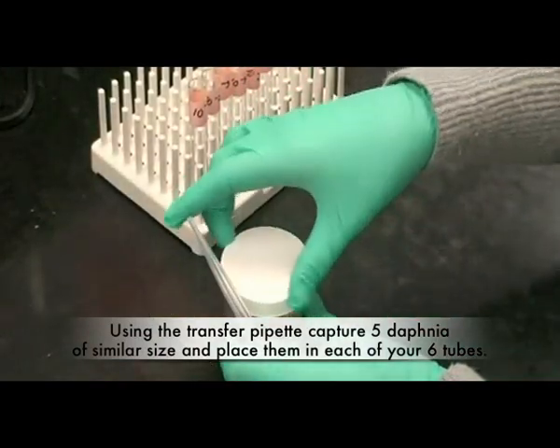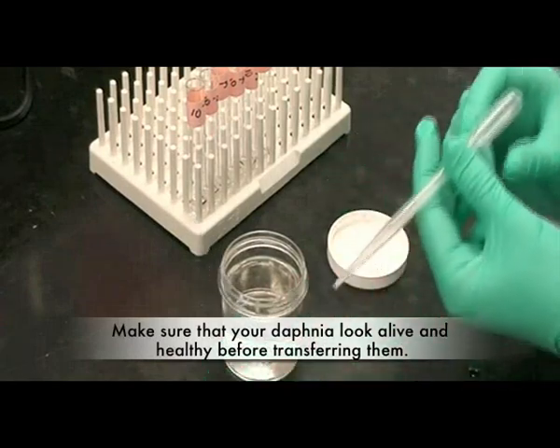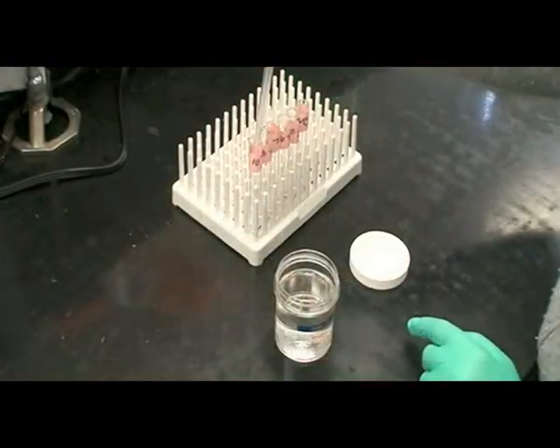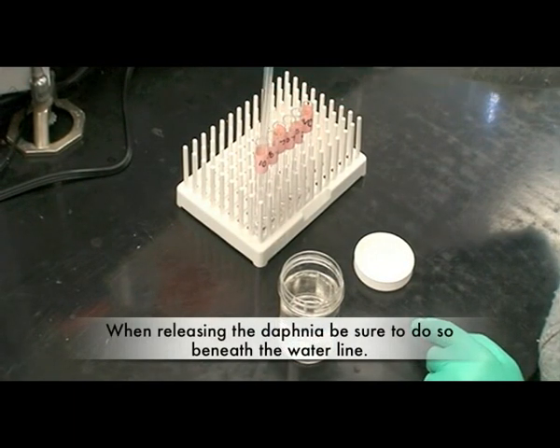Using the transfer pipette, capture five Daphnia of similar size and place them in each of your six tubes. Make sure that your Daphnia look alive and healthy before transferring them. When releasing the Daphnia, be sure to do so beneath the water line.